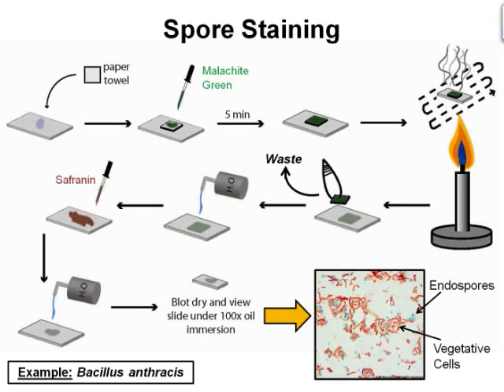Spore production is an important characteristic of some bacteria, allowing them to resist adverse environmental conditions such as desiccation, chemical exposure, extreme heat, etc. The identification of spores is also important to the clinical microbiologist for analyzing a patient's body fluid or tissue since there are not that many spore-forming genera. In fact, there are 2 major pathogenic spore-forming genera, Bacillus and Clostridium, together causing a number of lethal diseases such as botulism, gangrene, tetanus, and anthrax.